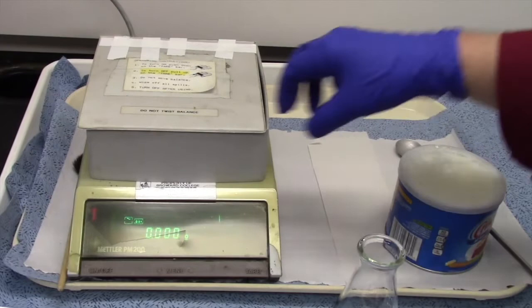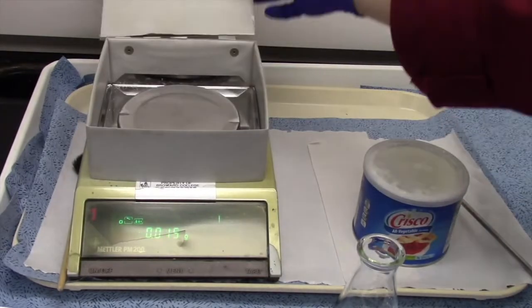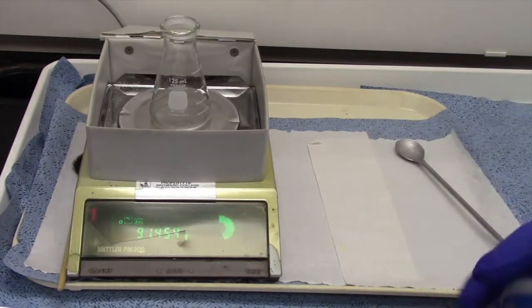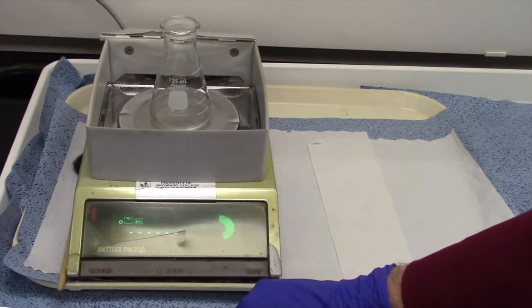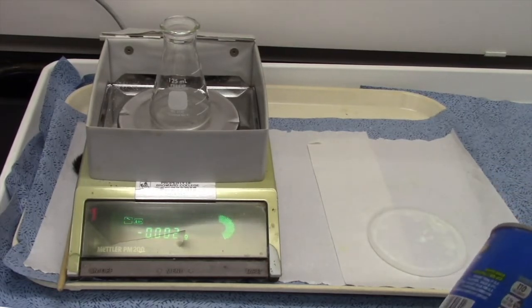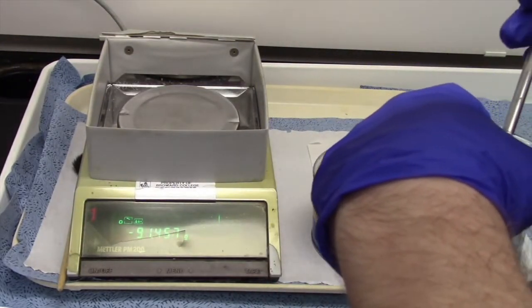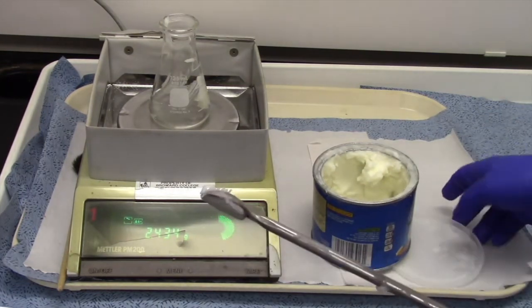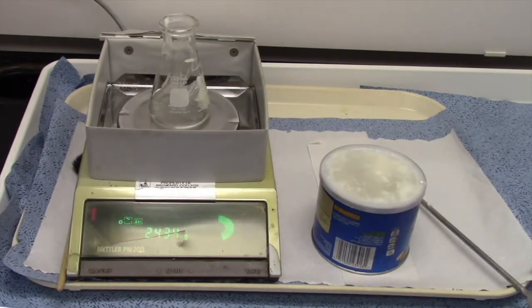Now we're going to weigh out 2.5 grams of this vegetable shortening — Crisco. You can buy that at any store here in Florida. I'm going to weigh directly into this Erlenmeyer flask because Crisco is really, really messy to work with. You're better off weighing directly into the flask. I'm going to re-zero it. Two and a half grams — doesn't take very much, believe it or not. We got 2.4; that's good enough. 2.5 is what we wanted, 2.4 is what we get. I'm very happy with that.